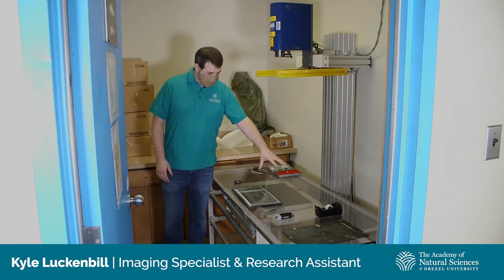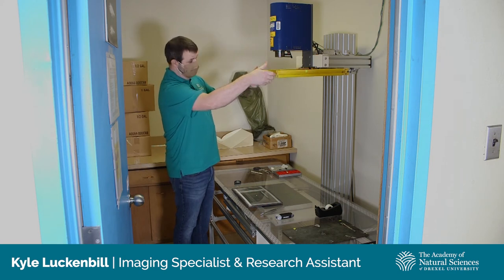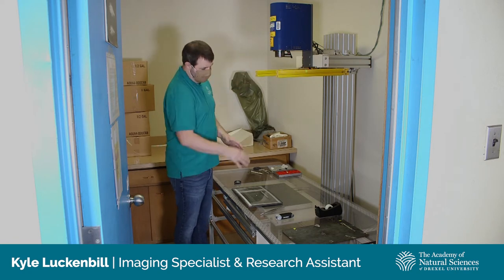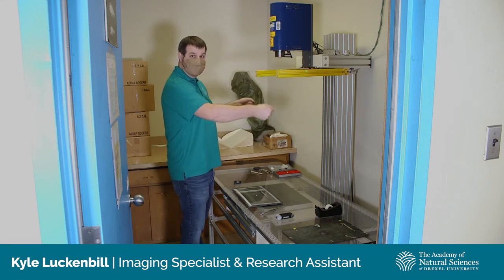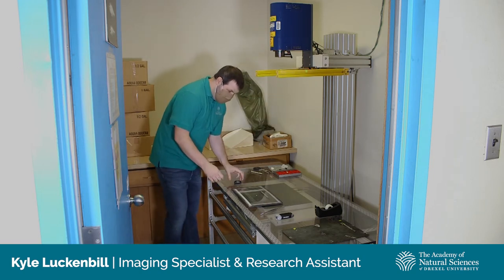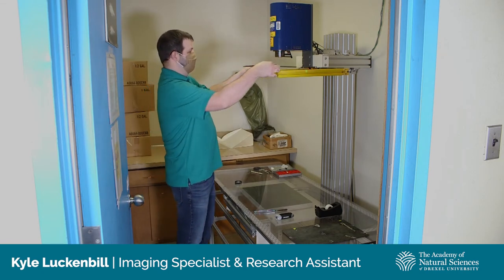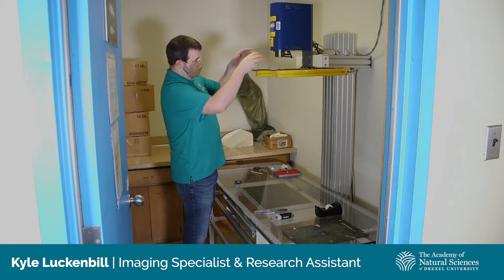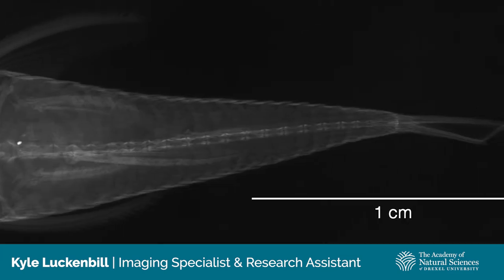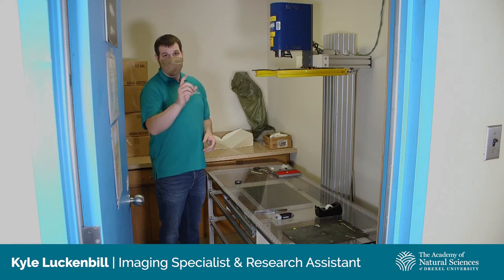Now we've moved on to the x-ray room. We're going to take some x-rays of our fish. We've got our x-ray source up here, and we've got our digital collector pad down here. We can place our specimen anywhere in between — the yellow part here moves up and down. So for a really small fish, we can move it up to the top; if we've got a larger one, we'll put it on the bottom. The whole apparatus moves back and forth, so if we have something really big, we can actually x-ray it in small pieces. By putting the fish up close to the x-ray source, this sort of works as a projector, so the small little fish will be projected almost the size of the pad, which gives us a lot more detail on the specimen. Then we'll close this door, head out of the room, and control everything by a computer on the other side.